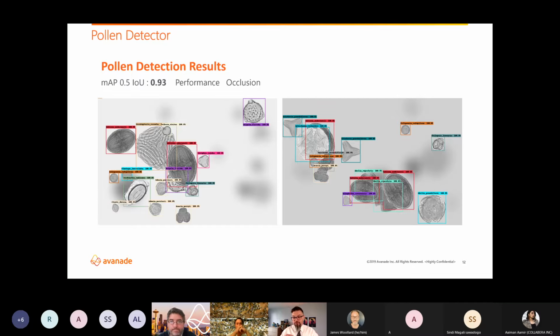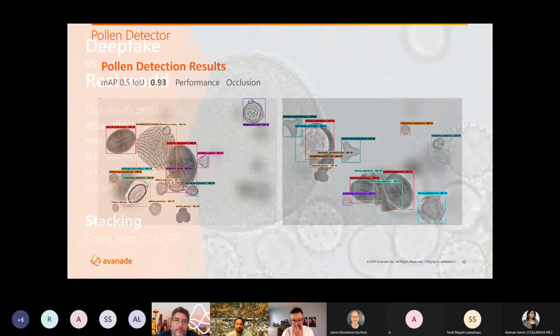After the first batch, we saw that there was not enough data, so that's why we decided to create the data to go on. And like Jonathan says, we optimize, we parameterize. It takes a few weeks to do that, to have the right algorithm with good prediction and something realistic.